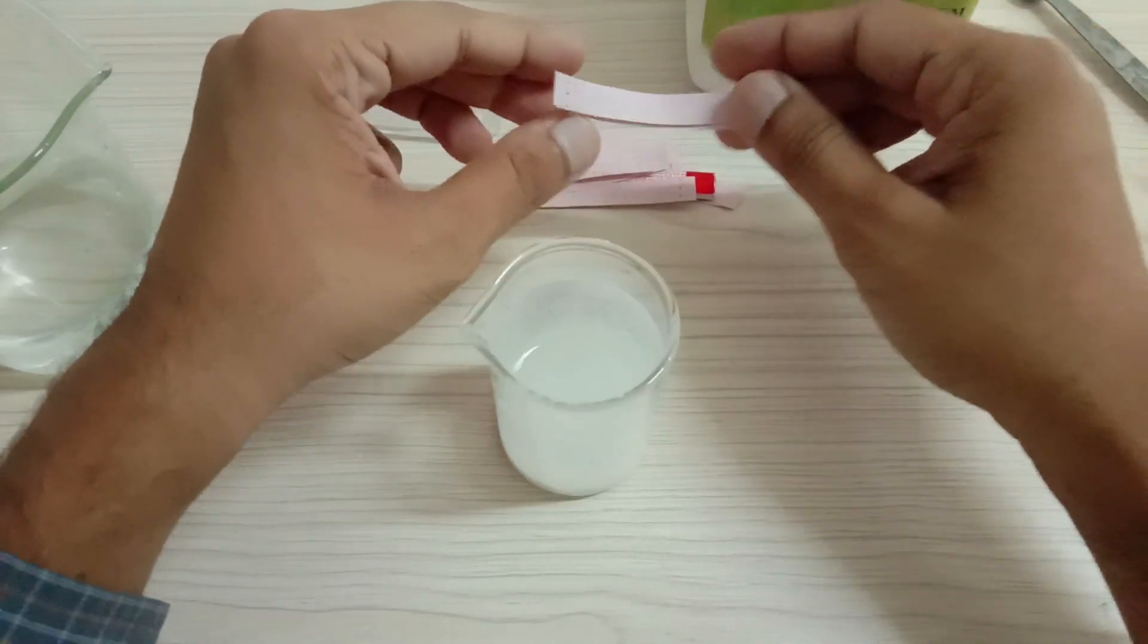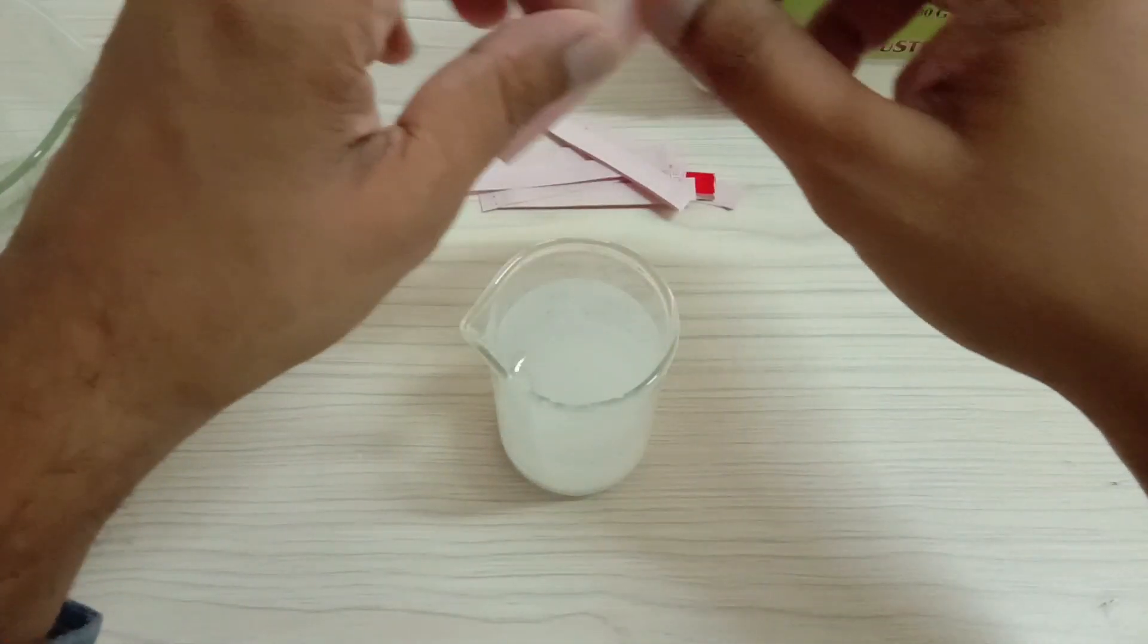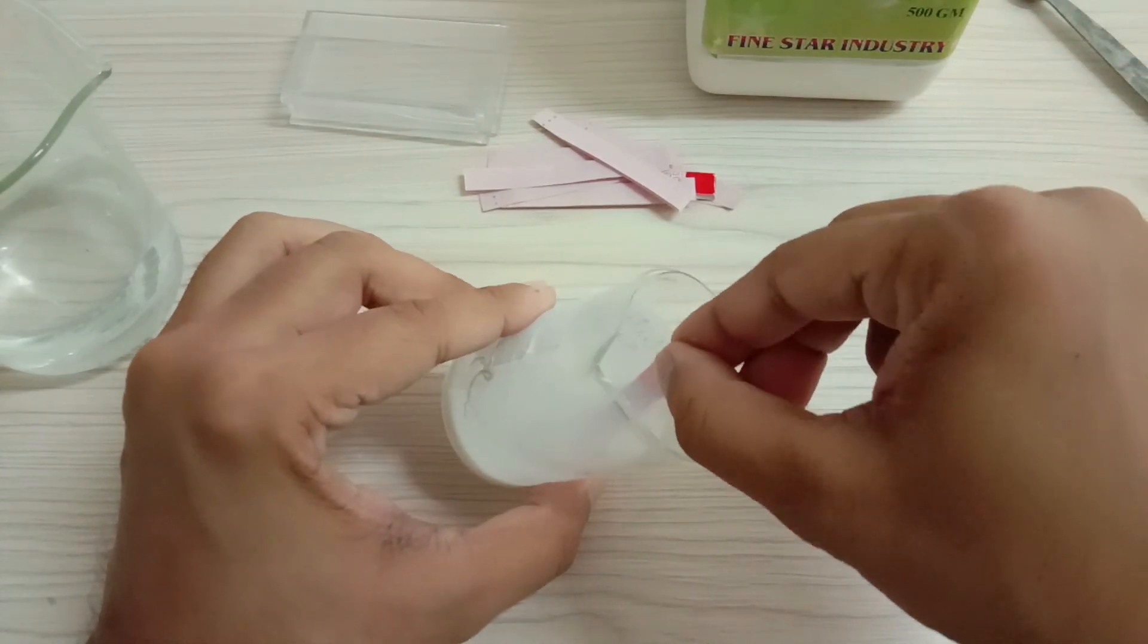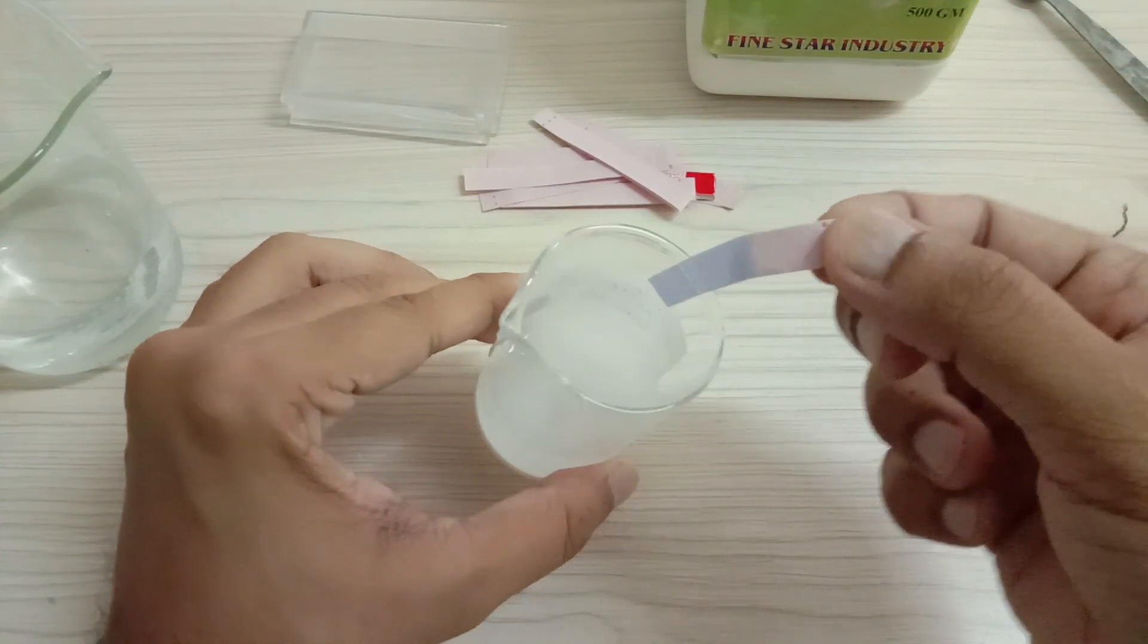So this red litmus paper, when added to the base solution, turns blue. See this, guys.